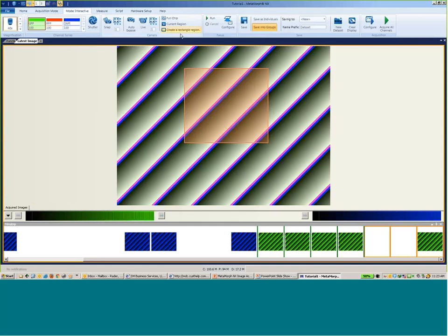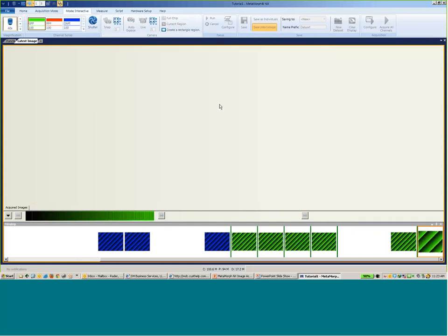That's there. Camera settings, these are like the special tab configurations that are in Metamorph 7. So the transfer speed, the gain settings, the trigger modes, and so forth would all be configured here. You can assign them to be per channel. So in this case, I have the gain set per channel. If I look now at the box up here, I have a gain control for each individual channel. So I have the option of making that setting per channel instead of globally through the camera settings.